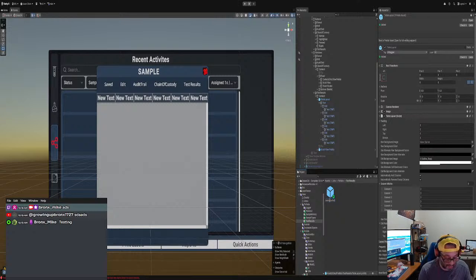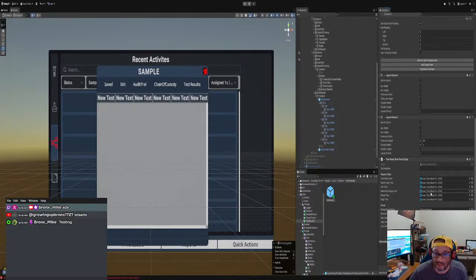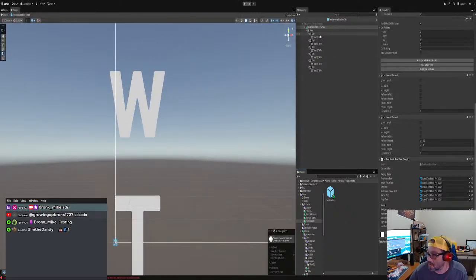Right, prefab, just to make sure we know it's a prefab because it's blue, but just in case, it makes it easier sometimes. And then we want to add a script to it, because remember the header is not going to be the script, and this just makes it easier because it perfectly aligns everything with the columns. So we're going to say test results row view right here, because I wrote it. Okay, doke. You guys got it, right? And then you want to double click it. Yeah, you want to double click here, and it looks weird here, but don't worry about it. It'll work out well.